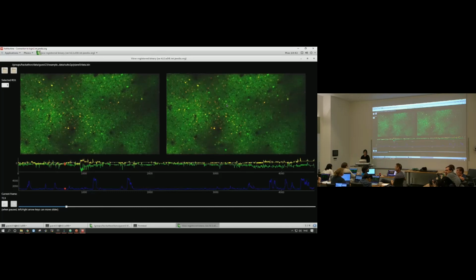But if they are bigger, then they'll be labeled as bad frames, because they'll have a bad correlation with the frame at any of the allowed positions. And because of that low correlation, they'll be labeled as bad frames.